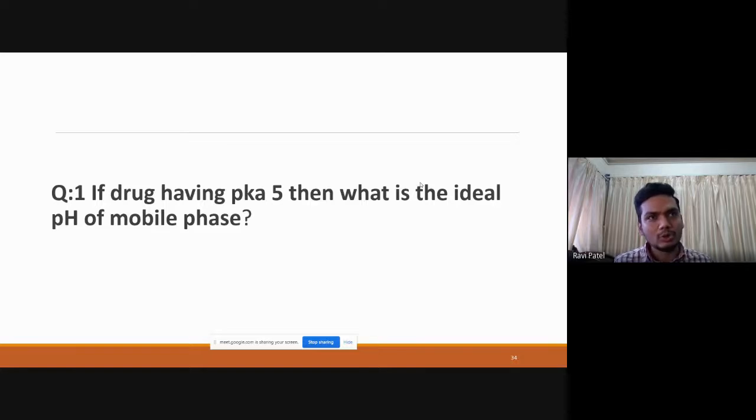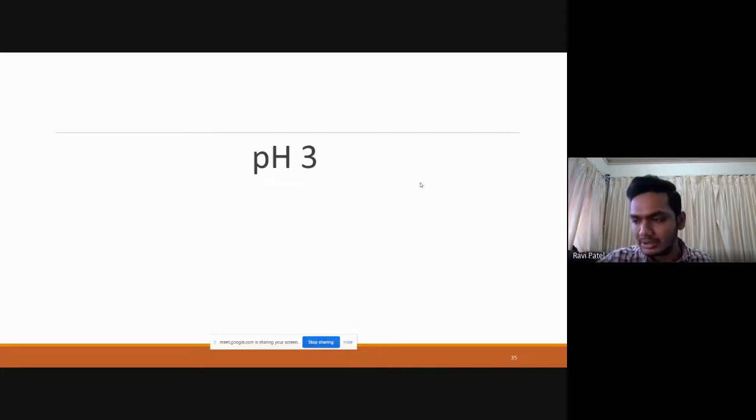And as we all know, in reverse phase HPLC, acidic condition is more suitable, right? So we should start our method development for a drug having a pKa of 5 at around pH 3, right? By this way we are decreasing our efforts, and we are developing a rugged and reproducible method.